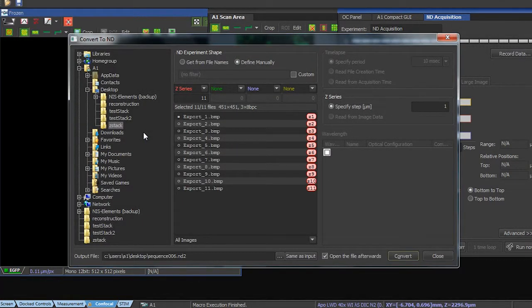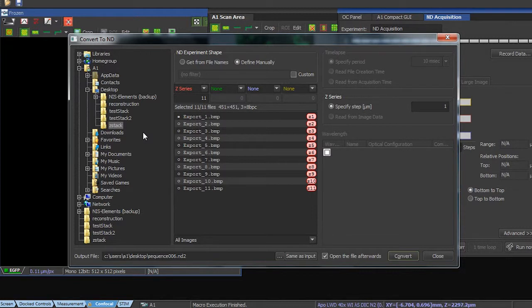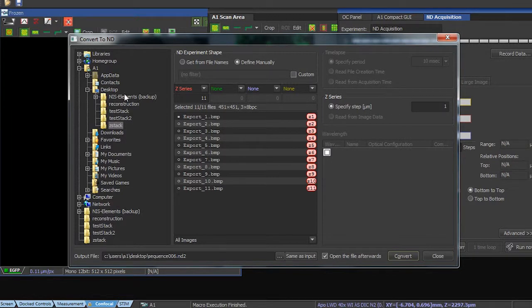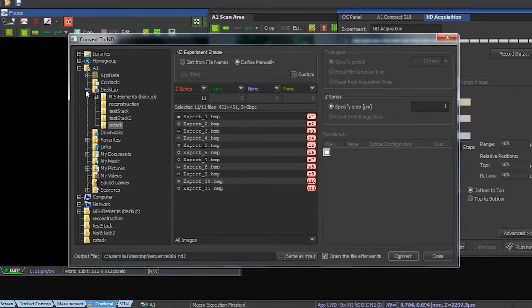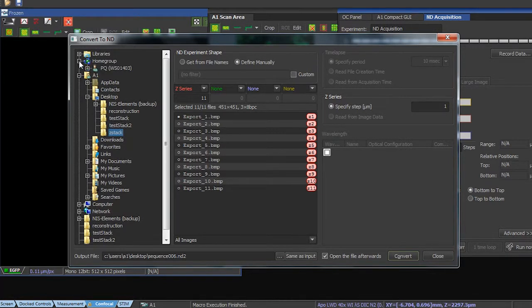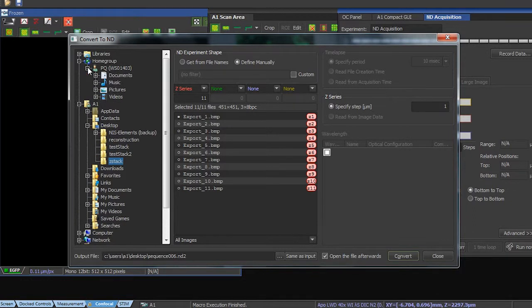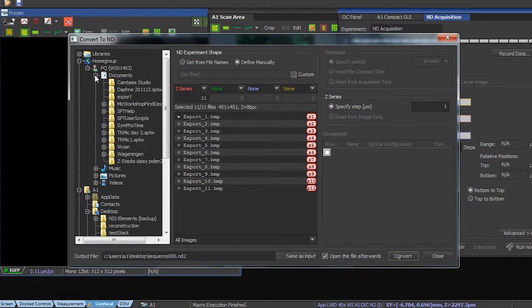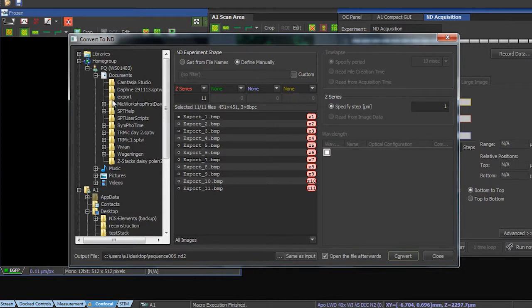And here, I have to get my data, which are actually in the PicoQuant computer. Both computers are connected through a home network. So I go to home group to access the PicoQuant computer. And here, under documents, I should find my folder that I have named export, which is up here.